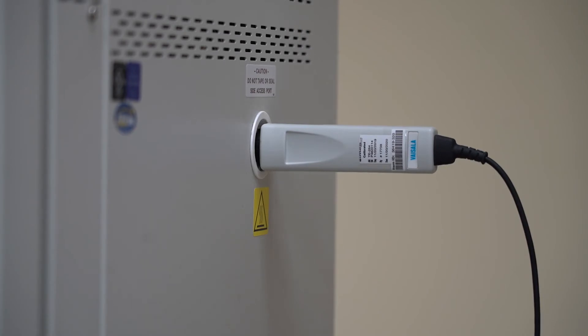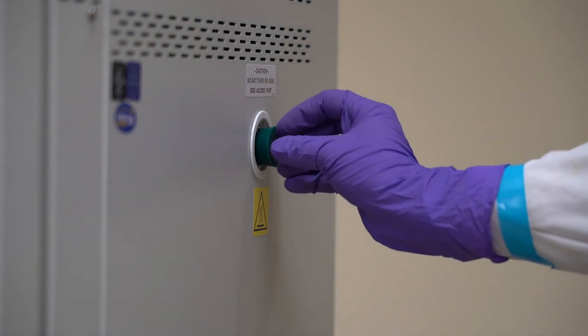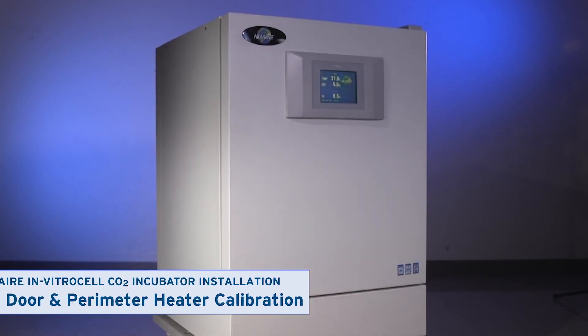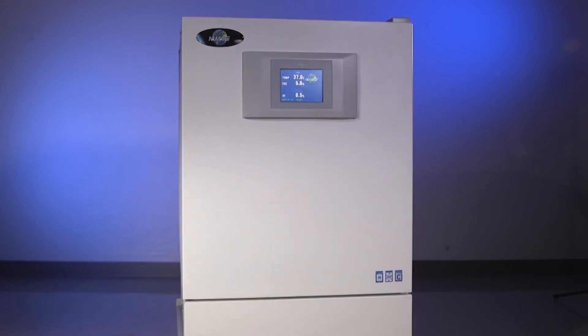Remove the hygrometer and replace the port plug. If necessary, skip ahead to the video that explains how to adjust the door and perimeter heaters.